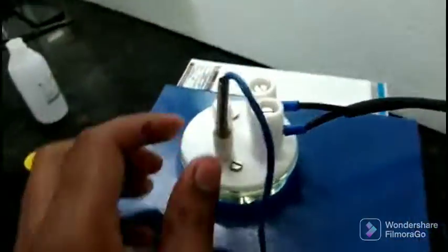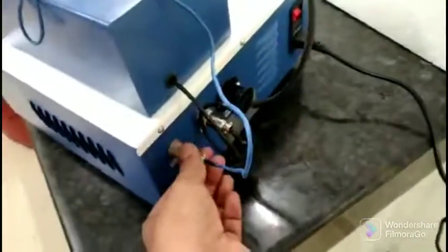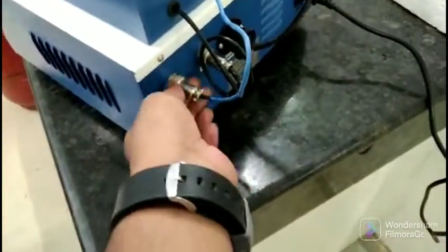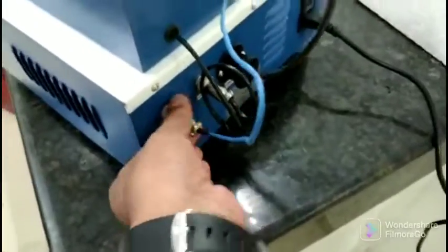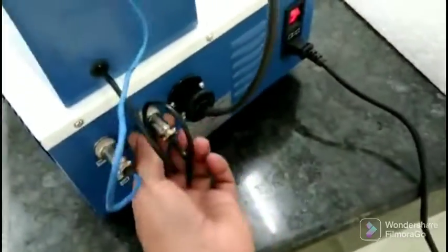And now we connect the temperature probe and put it inside your heater. There is a slot given in your heater, just connect it like that and rotate it. Keep this temperature probe tight to avoid fluctuation.